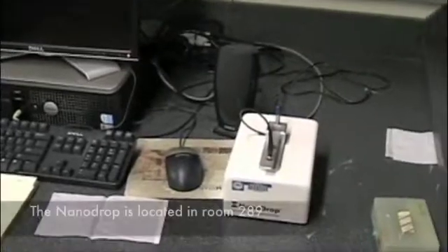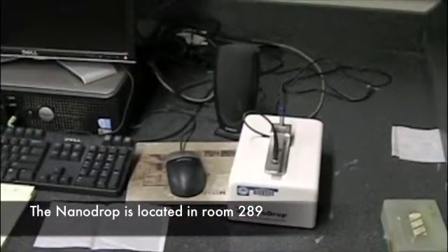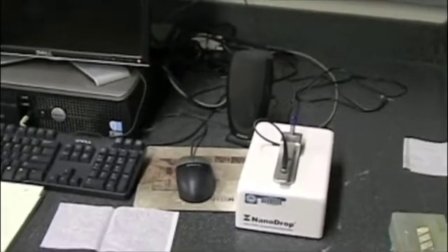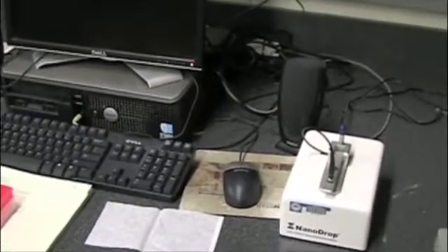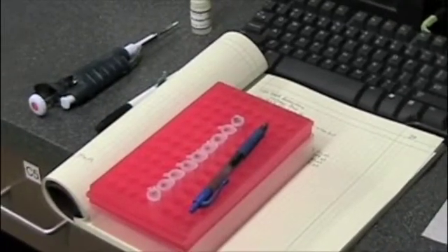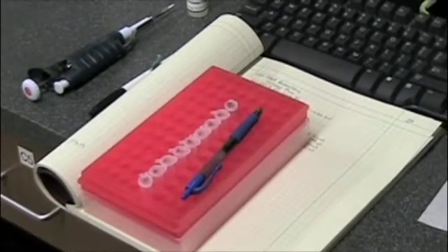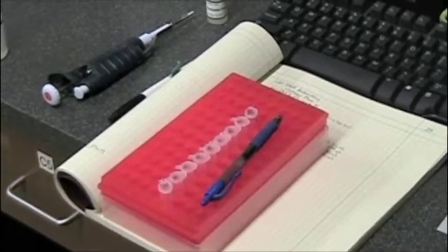This is the Nanodrop, a spectrophotometer used to measure the quantities of nucleic acids in solution. We're going to quantify our samples here to determine how many nanograms of DNA actually came out of the gel fragment that we just cleaned through the gel extraction process.